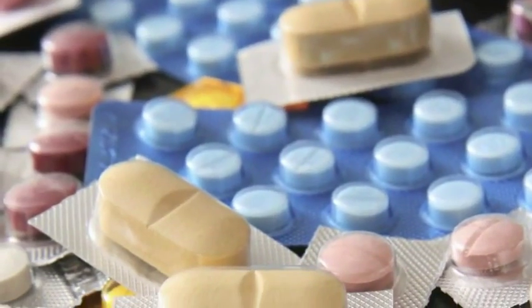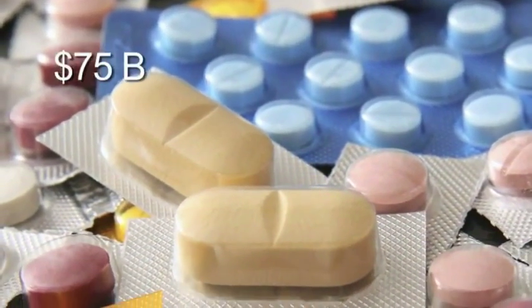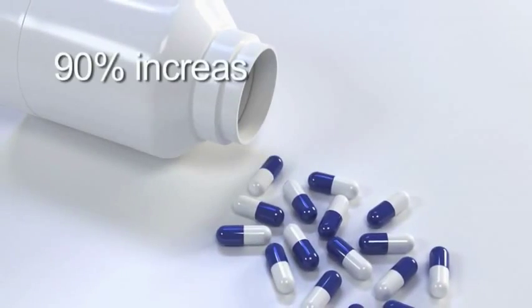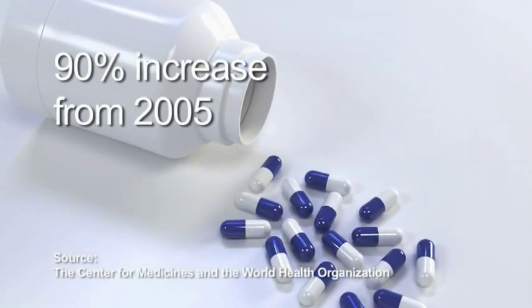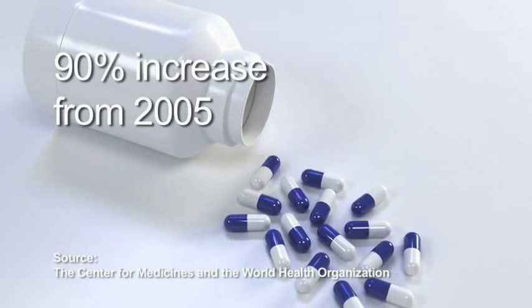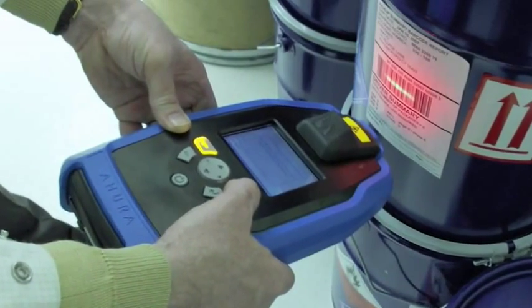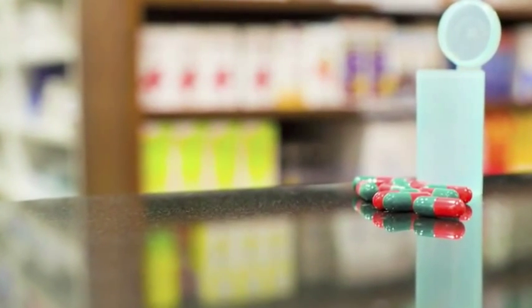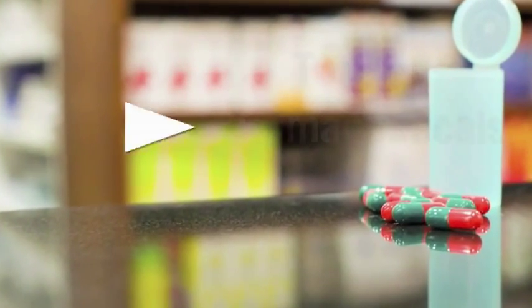Sales of counterfeit drugs are expected to reach $75 billion in 2010, which is an increase of more than 90% from 2005. TruScan provides field inspectors with the ability to detect counterfeit product in the supply chain, along with the ability to add authentics to the TruScan library and verify against samples collected in the field.